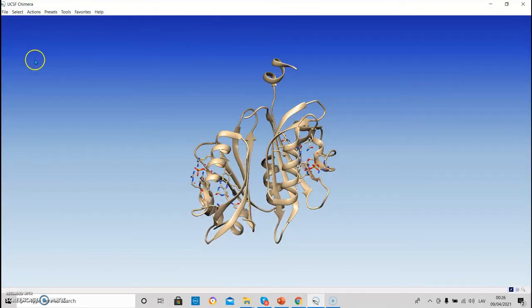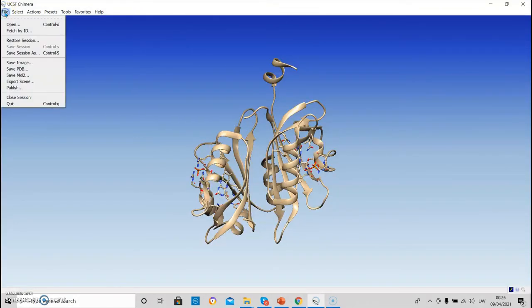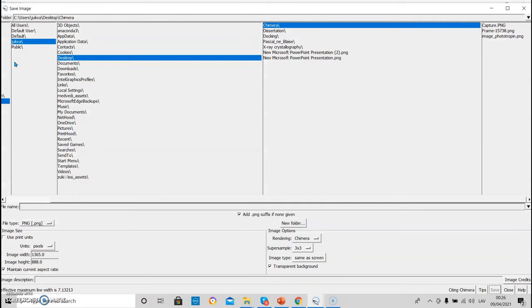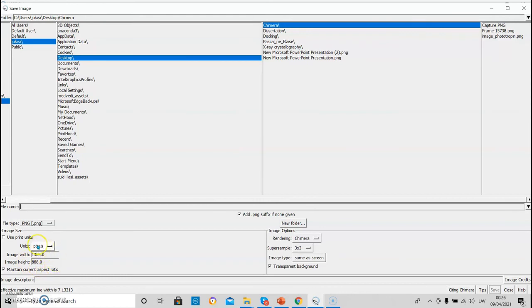To save the image, we can go to file, save image. Here we have to provide the name of the file. Here we can choose the format. I will choose PNG. Here we have to choose the dimensions. Here we can make the image background transparent.